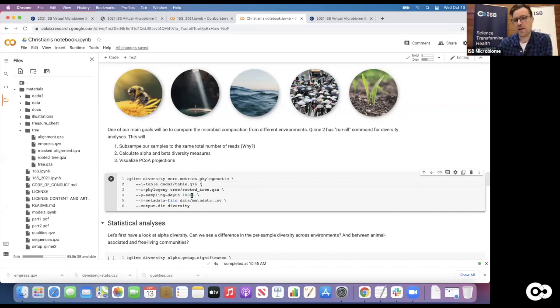The disadvantage is, if I have a sample with 1 million reads and I only do an analysis based on 10,000 random reads from that sample, obviously that might not be representative of the entire sample. And even if I did it a few times, it might still be a bit odd. So there's definitely a loss of data involved here. It's not the only way to normalize that. We will actually look at a different normalization technique at the very end, where we try to transform the data in a way that sequencing depth, or the number of reads per sample, is not such a big influence on the value. But here, by default, it's using that subsampling.